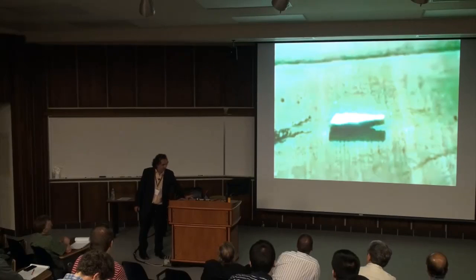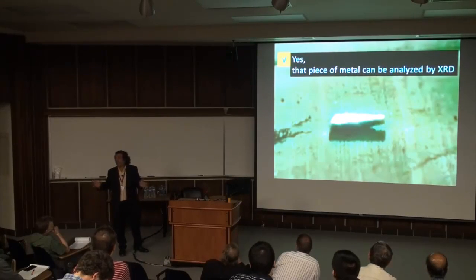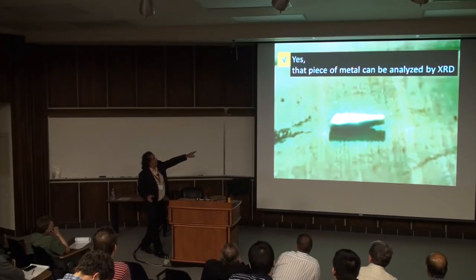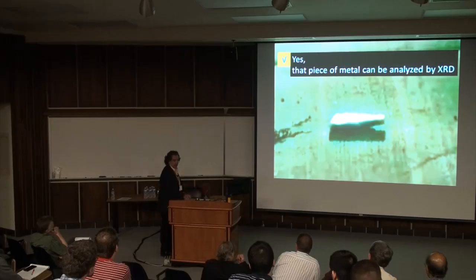First, okay, a piece of sample there. That piece of metal can be analyzed by X-ray. Rough like that, parallel beam optics will be a good thing to do. No, you don't need to cut, just stick the thing there.